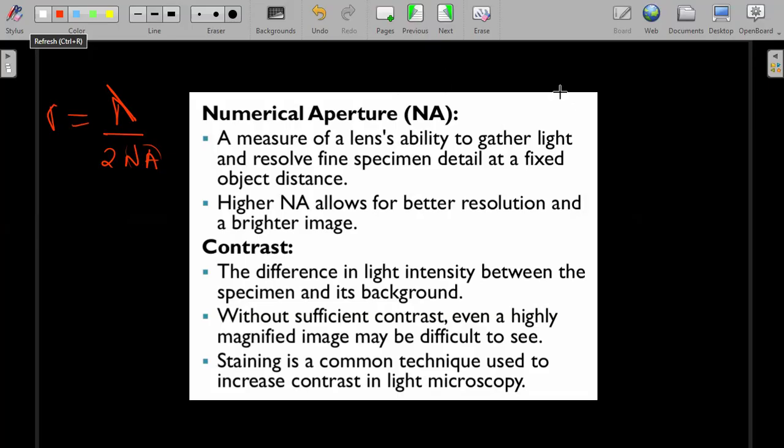How we are going to differentiate these two things is that we are going to be using different types of stains. So we'll be using stains to differentiate two things. One of them we are going to discuss is gram-negative and gram-positive bacteria. So we'll be using certain stains to differentiate these two bacteria. Using those stains, we are able to tell which one is a gram-negative bacterium and which one is a gram-positive bacterium. Like that, isn't it? So that's our contrast.